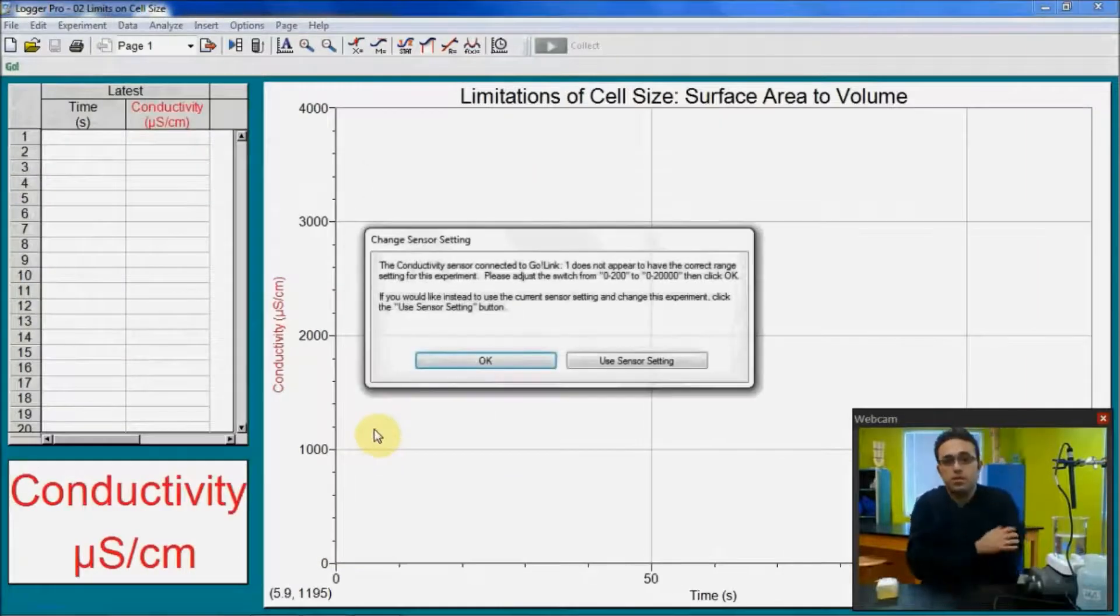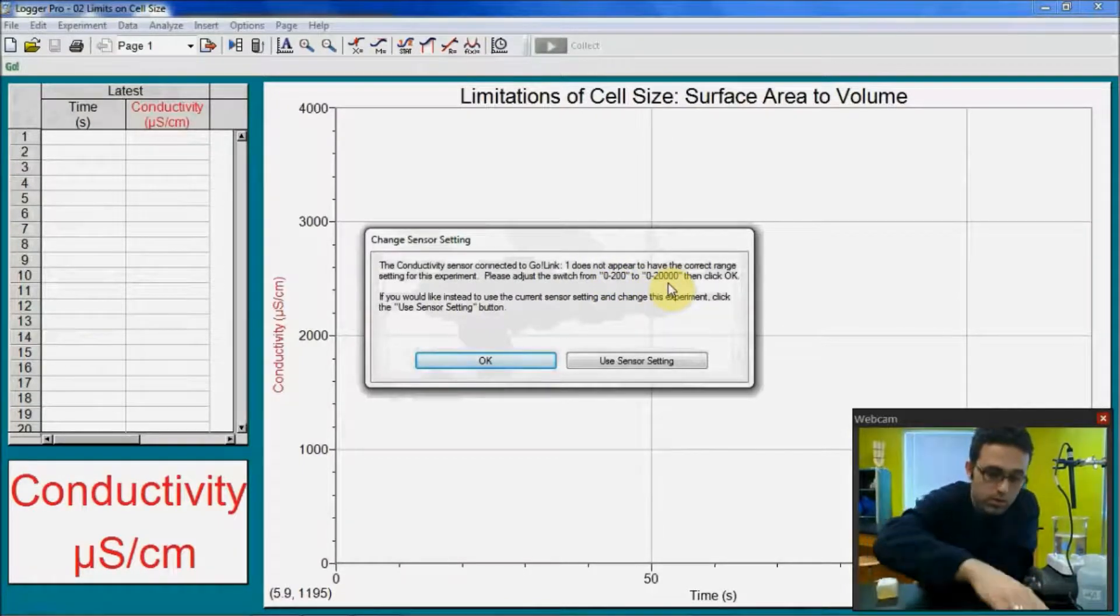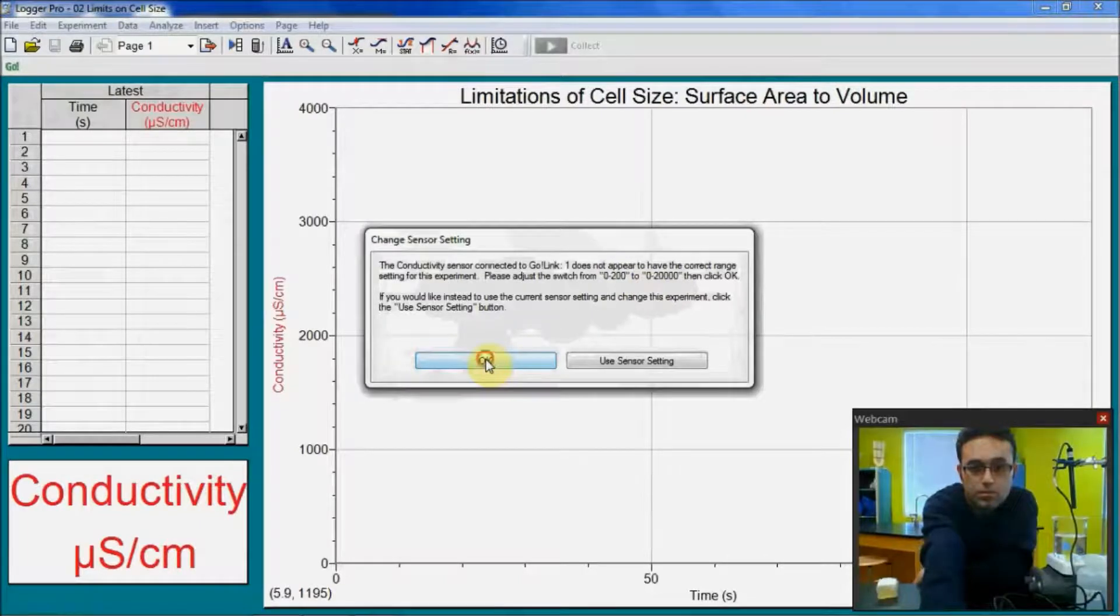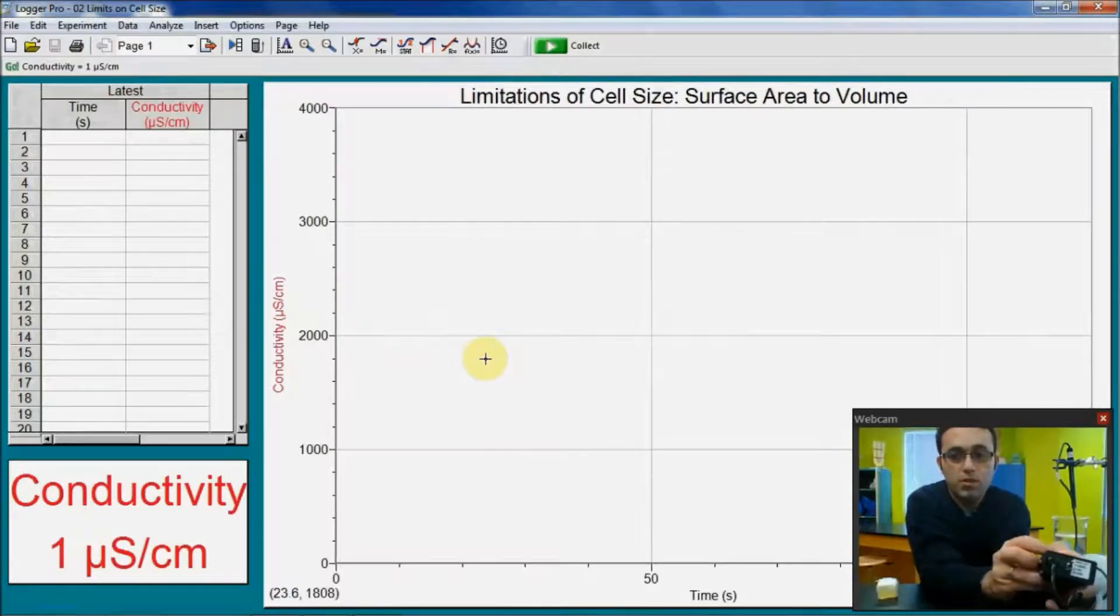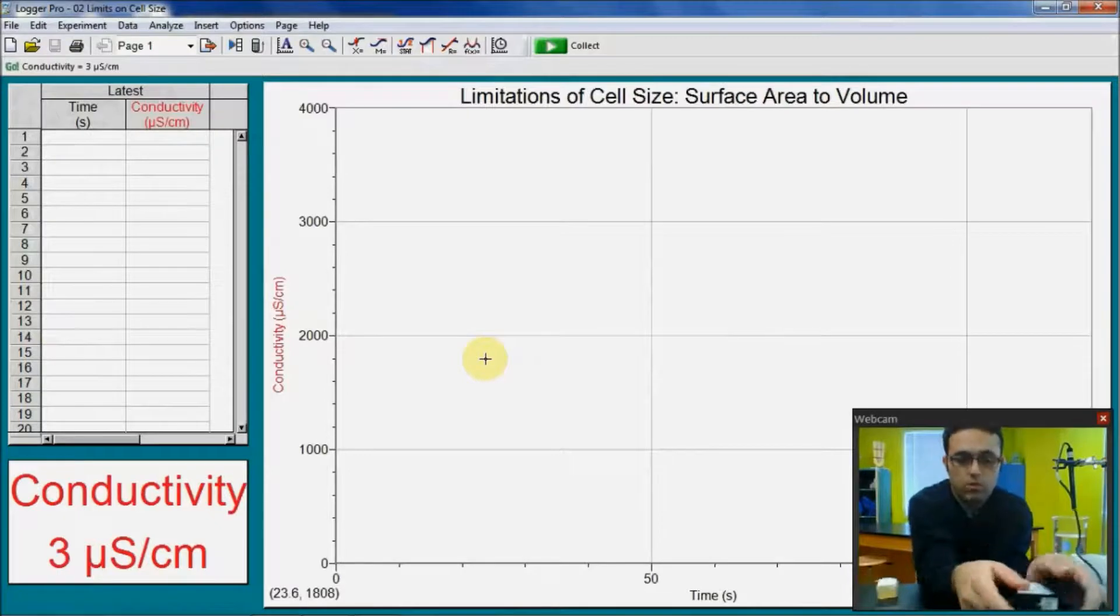Click open. It will open the preset file for you. And it is asking you, please adjust your conductivity sensor. Switch it from 0 to 200 to 0 to 20,000. And now I'll click okay. So there are three different choices of data collection on this, ranges for your data. It's 0 to 200, 0 to 2,000, and 0 to 20,000.